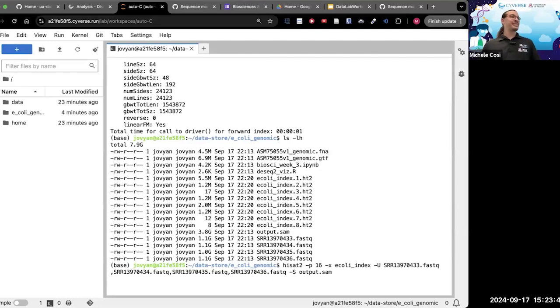Are you in the right directory? Are you in E. coli genomic? You're still in the home folder. Okay, everybody. It's Jeff's fault.